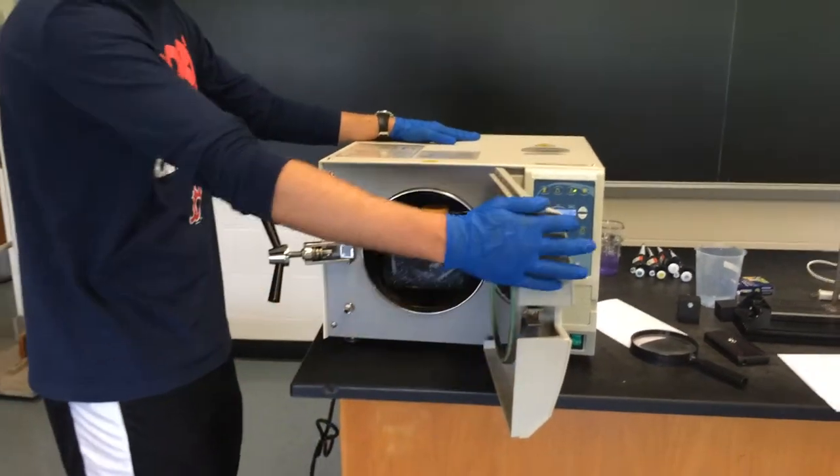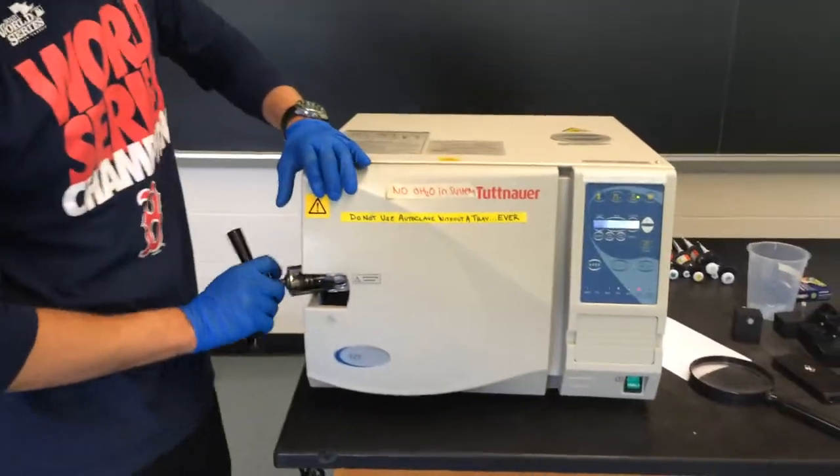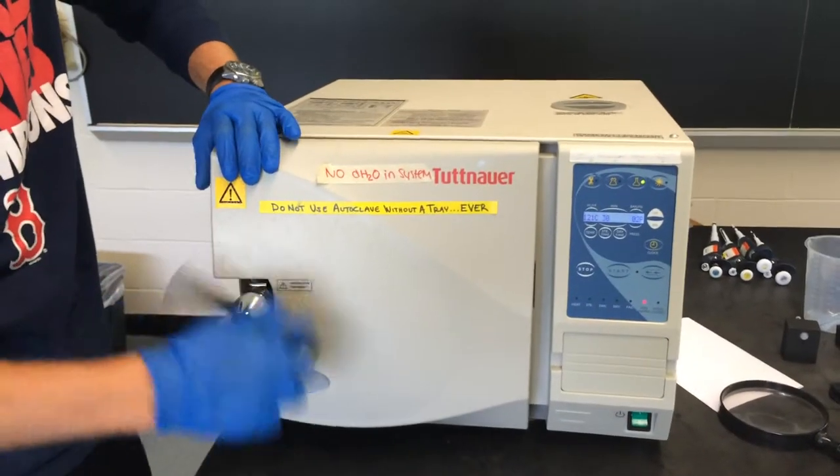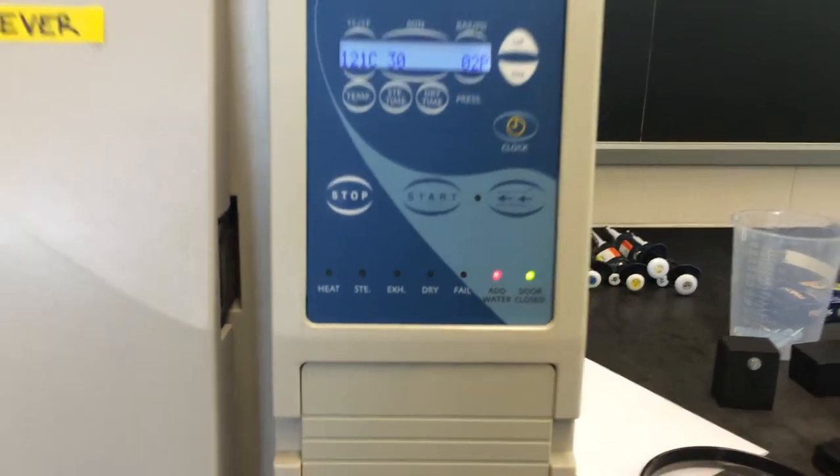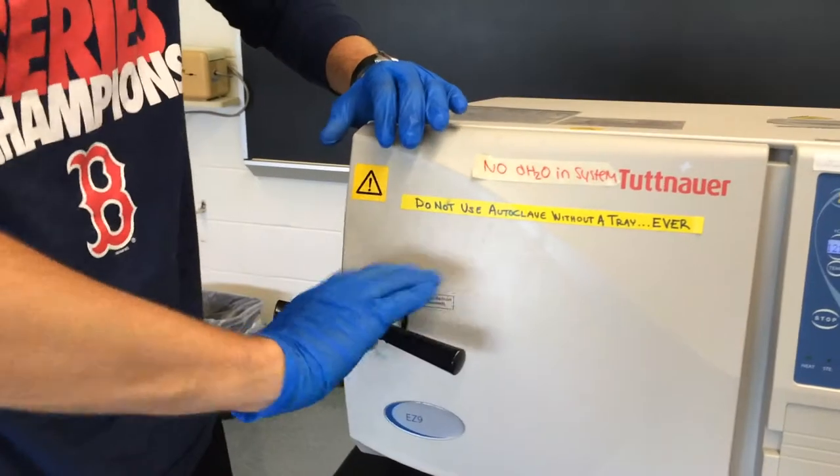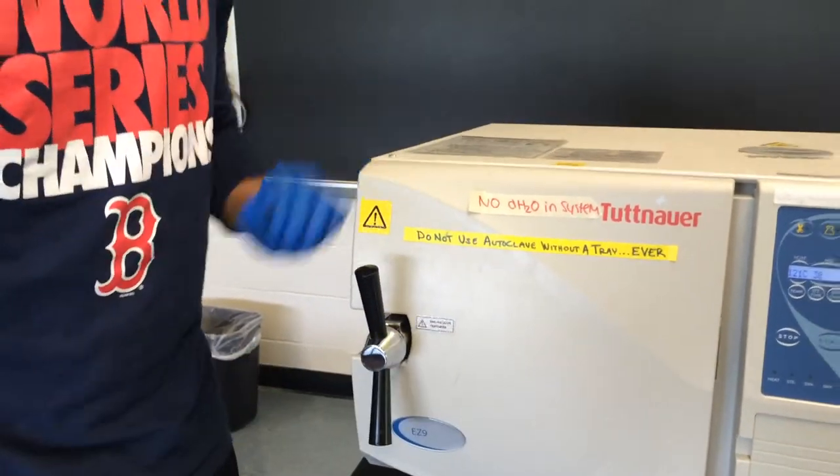Close the autoclave door. Tighten the handle until the door close light comes on. Then, you want to tighten it another one and a half turns or so, just to make sure it's tight.